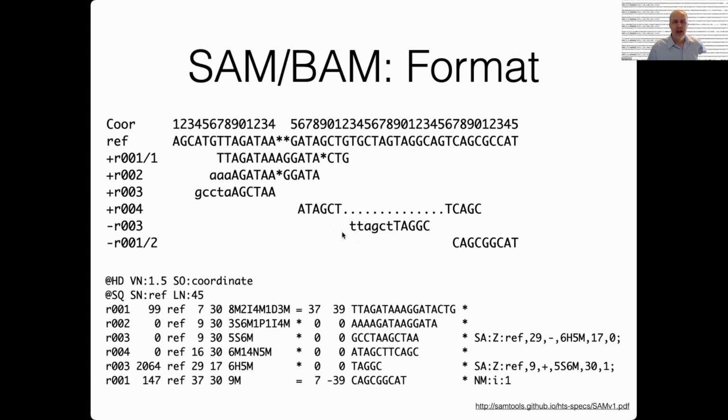Maybe not. Actually, it might show lowercase for what's called soft clipping, where again it's like matching this and not matching that. I can't remember. I'd have to check. But yeah, if it does show that in a real BAM file, it's going to be bases in the read that don't actually match the reference.